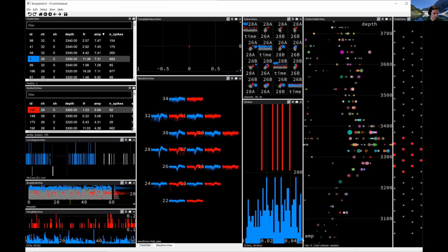And so actually now we've been able to see these gray vertical lines are a 2 millisecond plus or minus 2 millisecond indicator. And we've been able to see by zooming in that actually all of the spikes are outside of that 2 millisecond window, indicating a clean refractory period, as I'll talk about more in a minute. Now, quick thing about how to navigate this GUI efficiently.